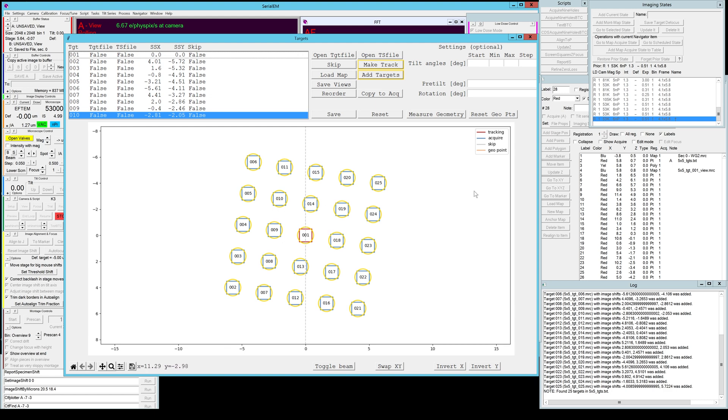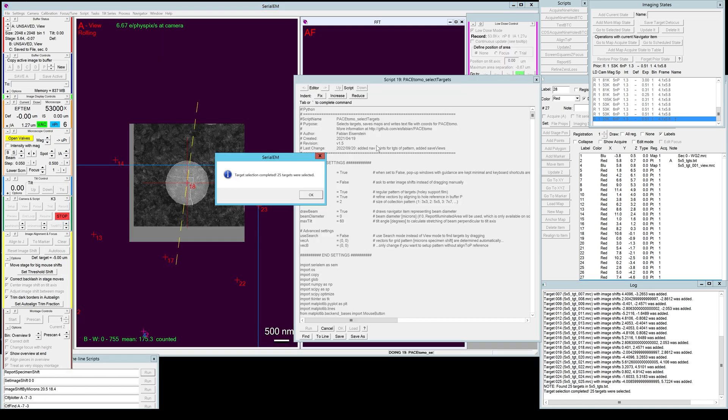The pre tilt rotation you can also specify for this pattern, but since you will be copying this pattern to different positions I don't recommend giving it a fixed pre tilt rotation because at every square the support film might have slightly different geometries.